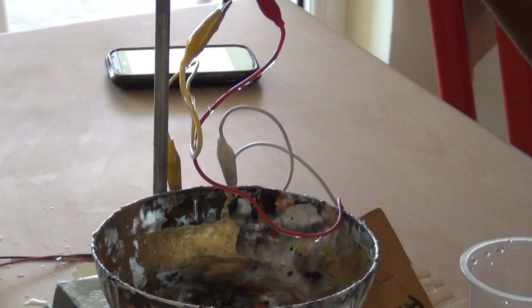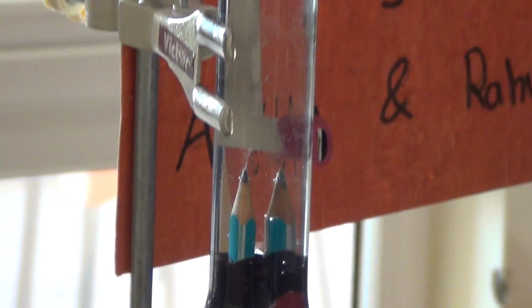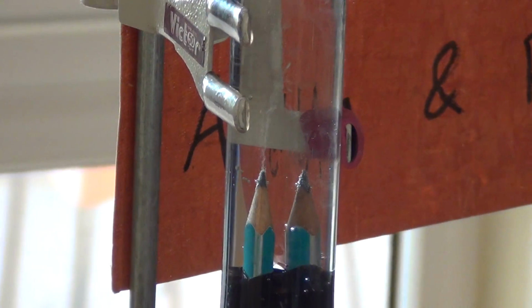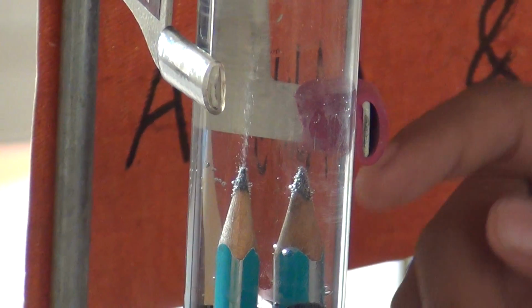And this would mostly be hydrogen because hydrogen is more in water, and in water it's H2. So that side is hydrogen because more of it's coming out, and this side would be chlorine.